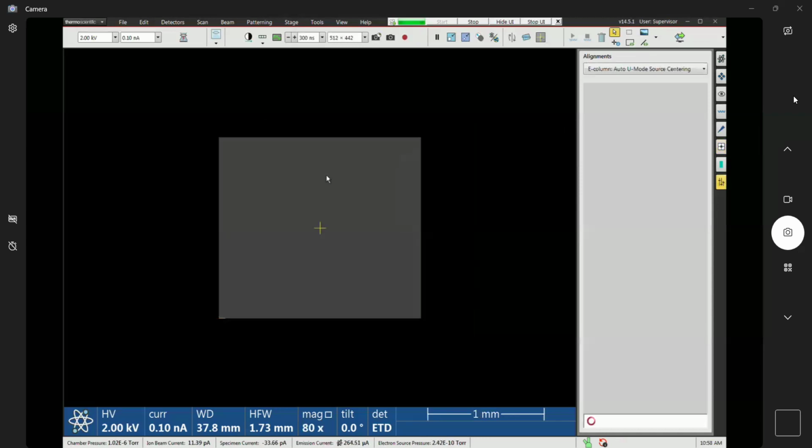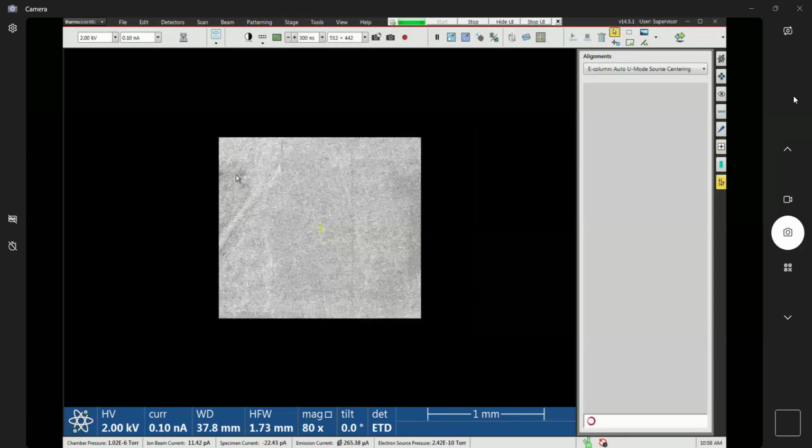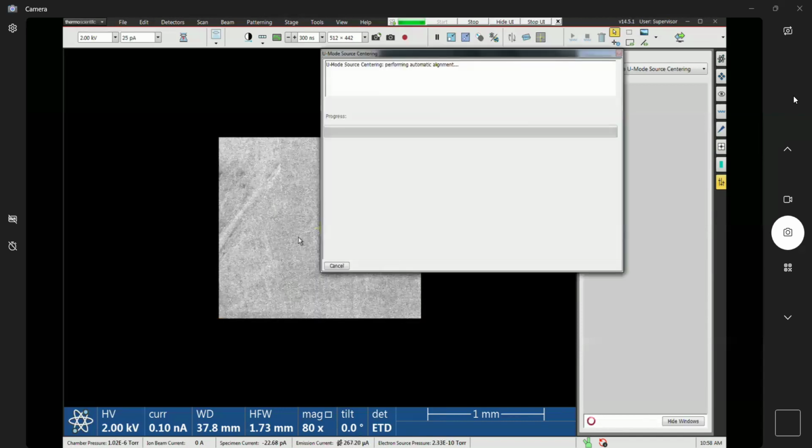Now you do want to be over an area here that's basically uniform. So you notice I don't have any big holes here in the center, or else I've seen that give a problem when it does this. Normally I'm doing this with 2 screens, so this is probably going to look a little bit different with just 1 screen, but we'll see what it does.